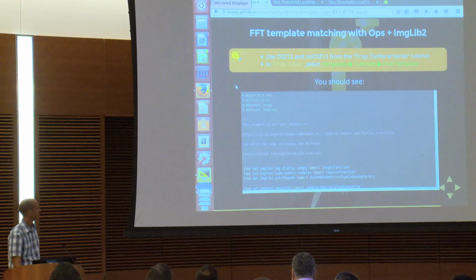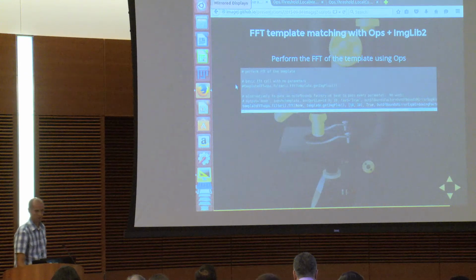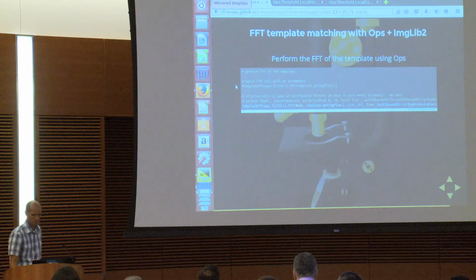So you should see this script. Again, it's in two places, embedded in the presentation and in the tutorials. First step, same as the others, set up parameters and imports. Then we use ops to perform an FFT.